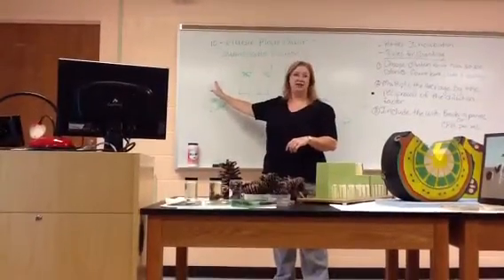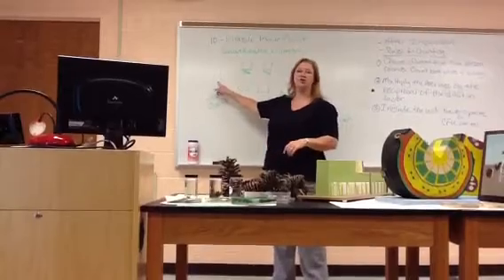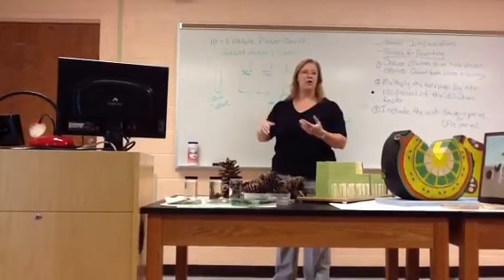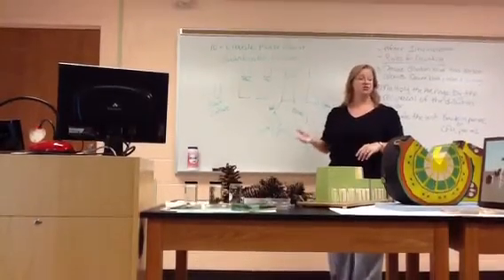Now, we can't just take a milliliter of that turbid stock culture, which probably has 1 trillion bacteria in it, and plate it on a Petri dish and get colonies like those in front of you, right? If we took a milliliter of stock culture and put it directly on agar, there'd be so many of them, they'd cover the whole surface. There'd be no way that you could count colonies. So we're going to have to do dilutions again, just like we did in Lab 9. We're going to have to reduce the concentration.